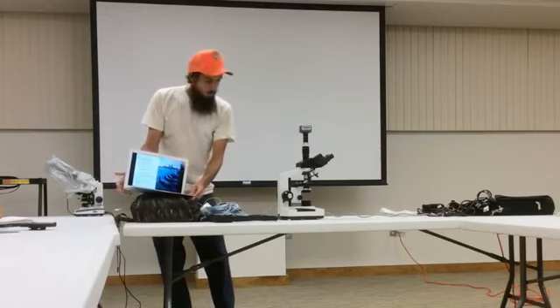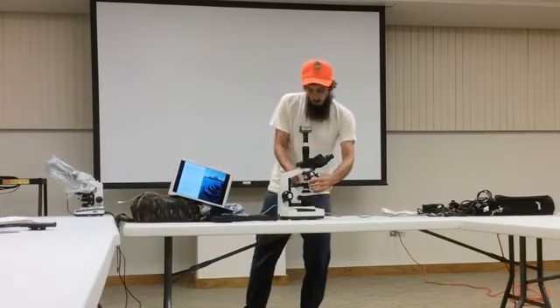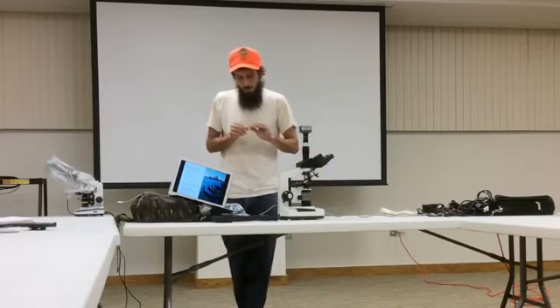So after I have my microscope, the next thing I wanted to go over is preparing a slide.